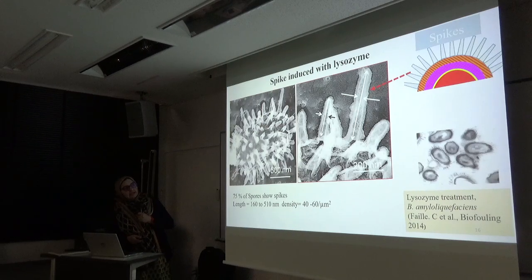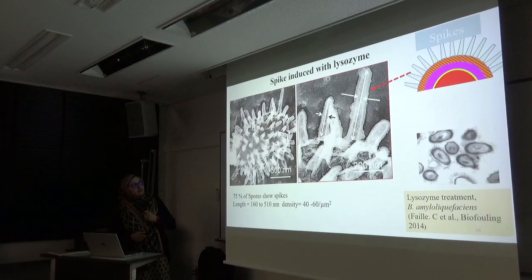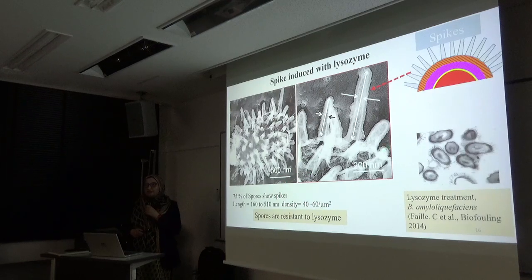Previously, some researchers tried the same thing on Bacillus amyloliquefaciens, and they found the same structure. And this time we could see the same structure in Bacillus subtilis under quick-freeze deep-etch electron microscopy. Based on these image analyses and observations, I assume that these spores are resistant to lysozyme.